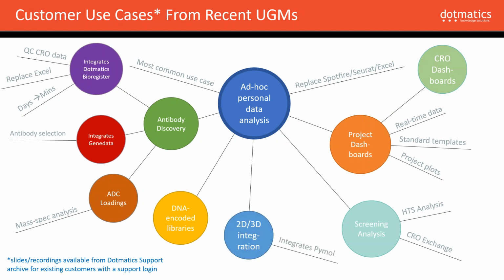And then finally, as you'll see when we get to the demos, the primary views in Vortex are 2D. It's not a 3D modeling environment as such, but it has been used to present back to chemists both 2D and 3D data integrated. And in one talk that we had, that integrated PyMol to visualize the 3D data. Now within Vortex, there are a number of native 3D viewers for molecules and proteins as well. So that just gives you a sense that it's a very flexible tool. There's a lot that can be done with it, from the simple personal analysis all the way through to some very complex team projects.